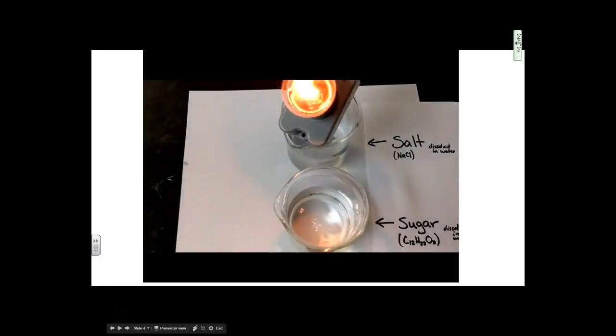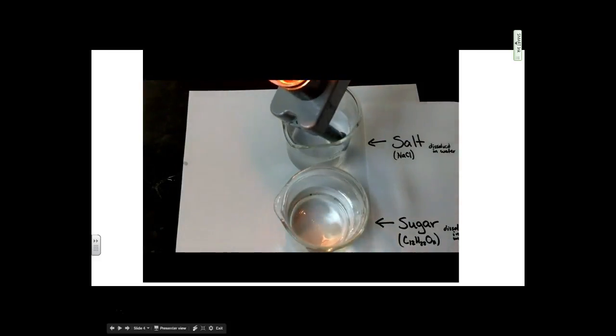And that's because there are no charged pieces, no ions. Now if I put it in salt, the light bulb lights up, and that's because the sodium and the chlorine have separated into charged pieces, sodium ions and chloride ions, and those can move from one electrode to the other and complete that circuit, lighting up the light bulb.